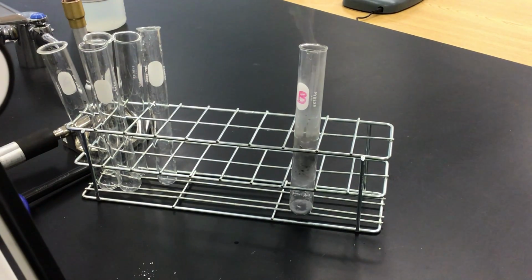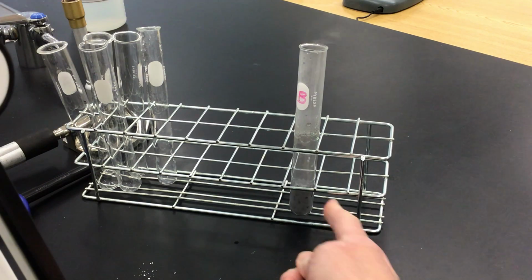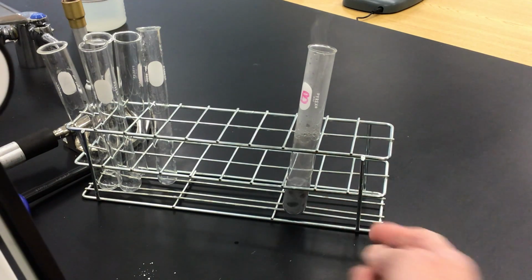It's pretty fun. That's a pretty violent reaction, so this gets really hot. That's not steam coming out, that's gas. And we'll talk about in just a second which gas it is. All right, so again, this down here is, woo, that's hot.